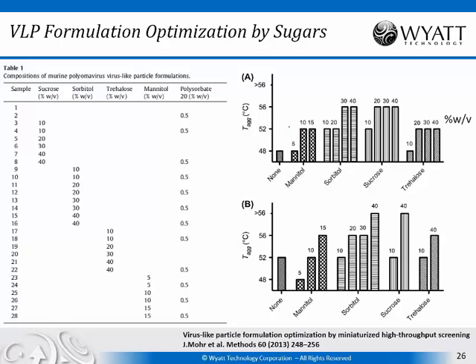So what they do is they load the plate, start ramping the temperature, and in the course of the temperature ramp, scan the plate and determine the average size and polydispersity at successive temperature points, and determine from that the temperature where it begins to aggregate. That's the aggregate onset temperature.